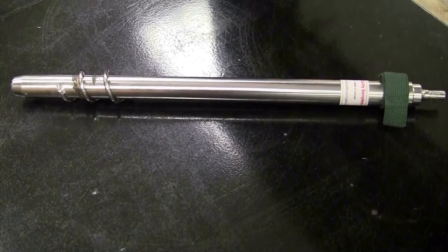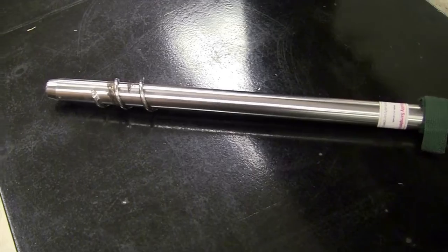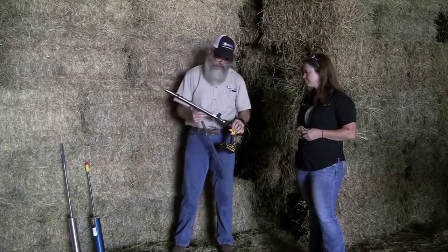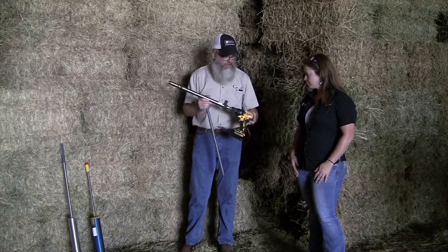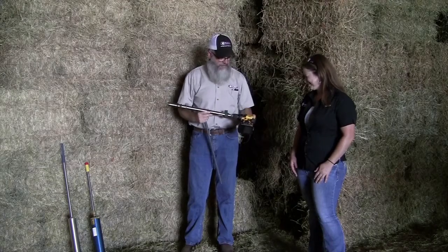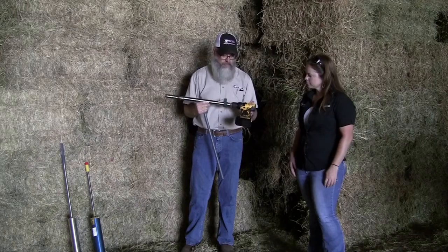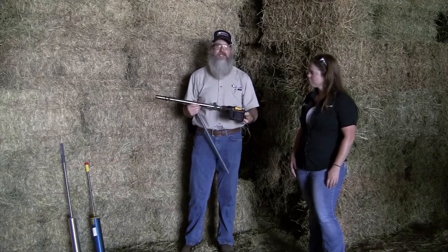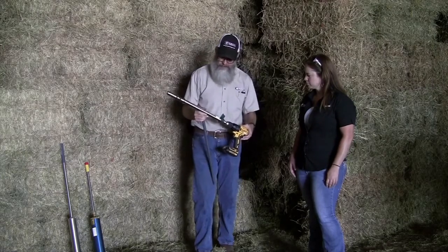And so, Lucy, we're going to talk a little bit about sampling. We have several different types of probes, right? We have a Penn State probe here, is what they used to call a Penn State probe, but now there's several different types of these on the market. This is a nice drill too, by the way, that you've got. These brushless drills are really a good strategy if you're going to be doing very many of these samplings, because they tend to make the battery last a little bit longer. So if you've got a good brushless drill, that should last a little bit longer.